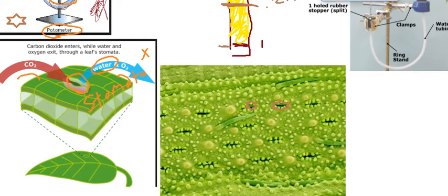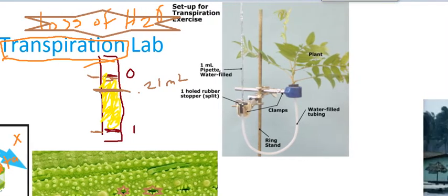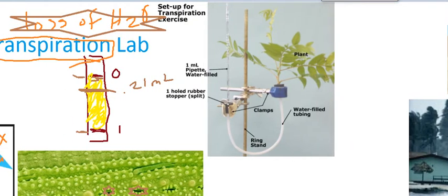That loss of water is something that happens naturally through a plant, and our potometer studied that. We used this pipette, which you can see in my right-hand illustration. We used a setup essentially like this one right through there.